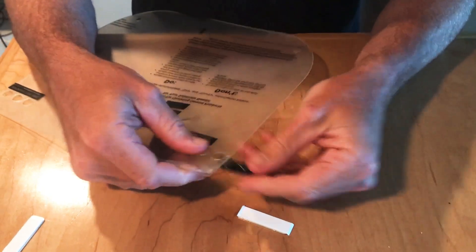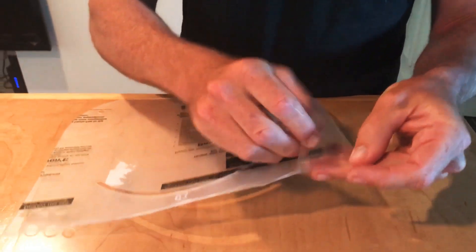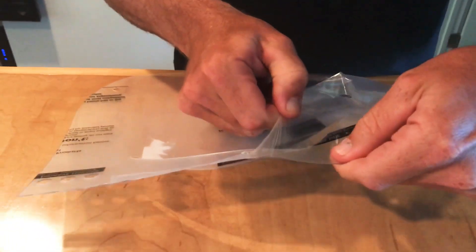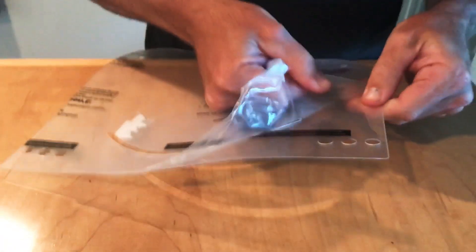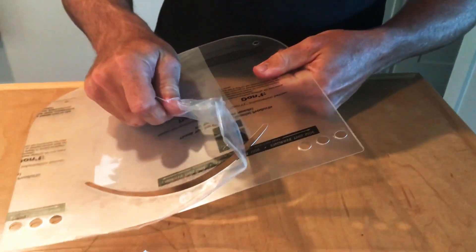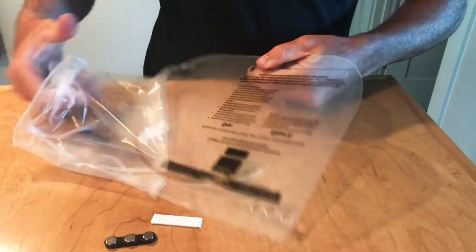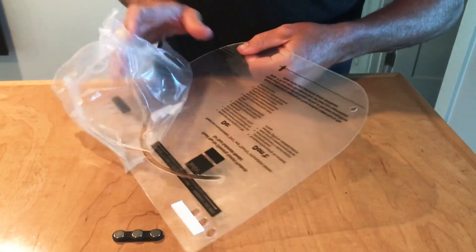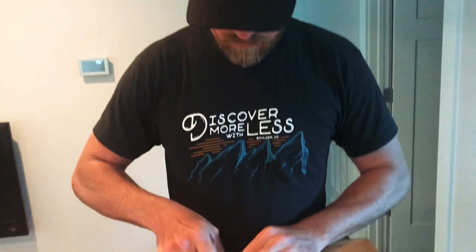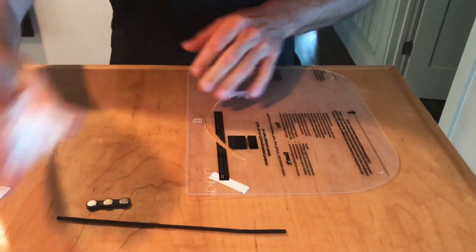It's really best if you slide this thing off just like that — the magnet comes off. So we've got our face shield here. What we're going to do is peel this protective backing off of it — takes just a second. Okay, same with the other side.